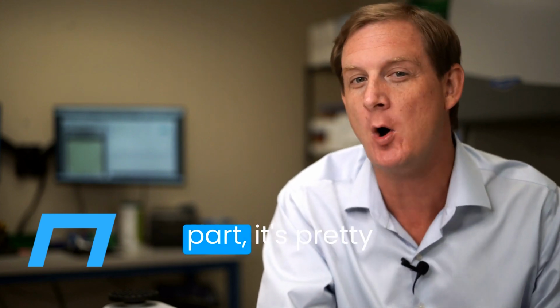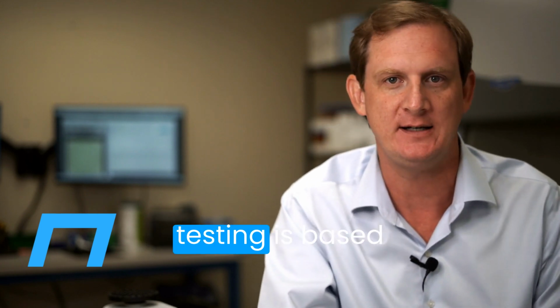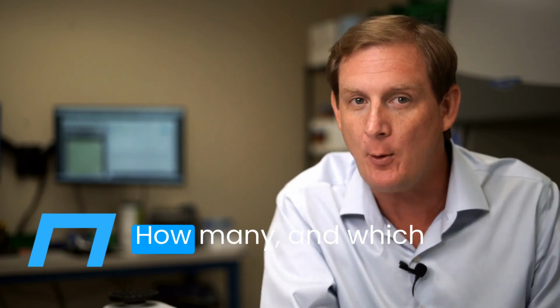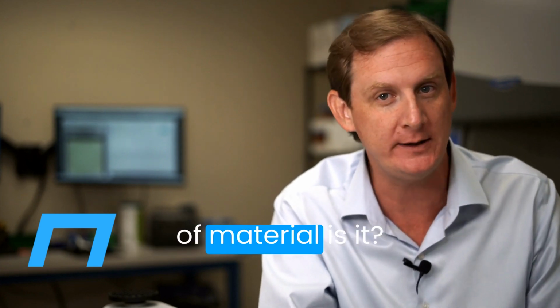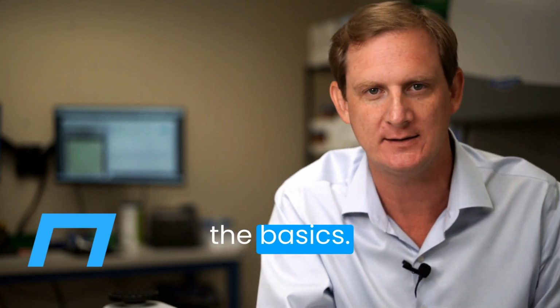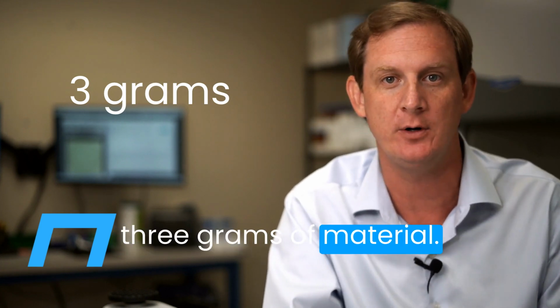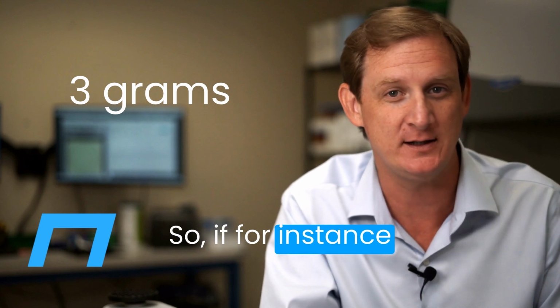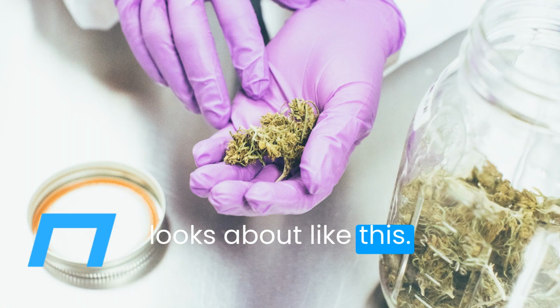Well, for the most part, it's pretty straightforward. The minimum sample mass needed for testing is based on two factors. How many and which tests are you ordering? And what kind of material is it? Let's start with the basics. A simple cannabinoid potency test requires 3 grams of material. So, if for instance you're sending a flower sample, 3 grams looks about like this.